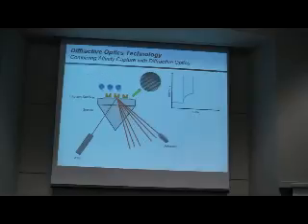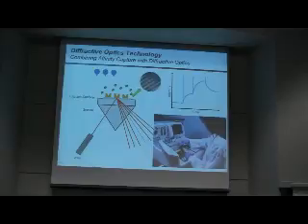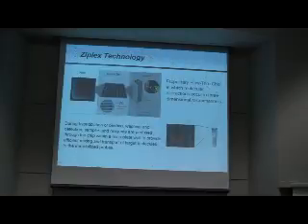We can introduce subsequent steps, capture antigen, measure that, and we can actually look at how it associates, which is useful in certain diseases. And this whole thing, because of the prism that's here, all the samples are up here, so we can do all of that without going through the samples, so we can monitor that in real time. So what we've done is built a research instrument and then a series of clinical instruments that basically deliver the sample, that deliver the solutions there, monitor this in real time, and applied this to a variety of applications that I'll show you in a moment.